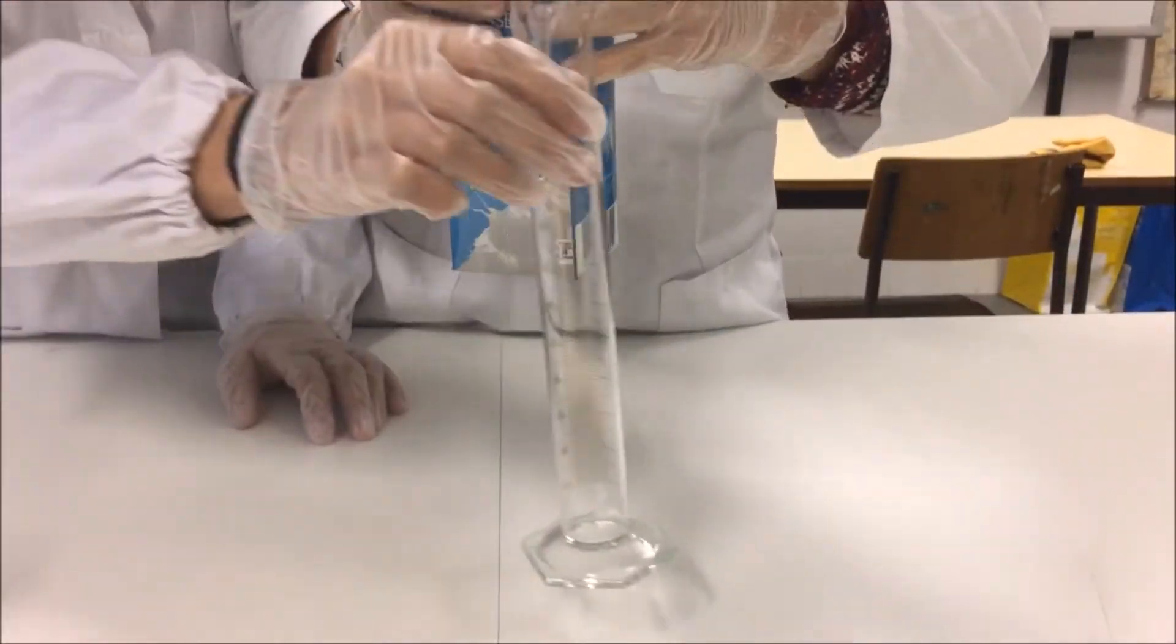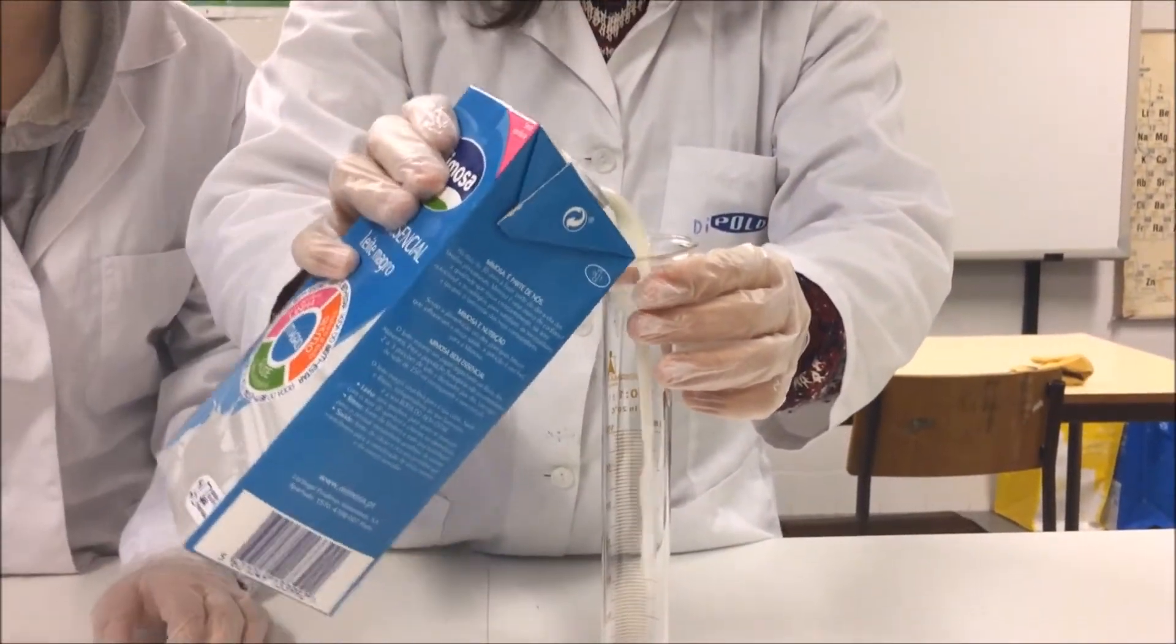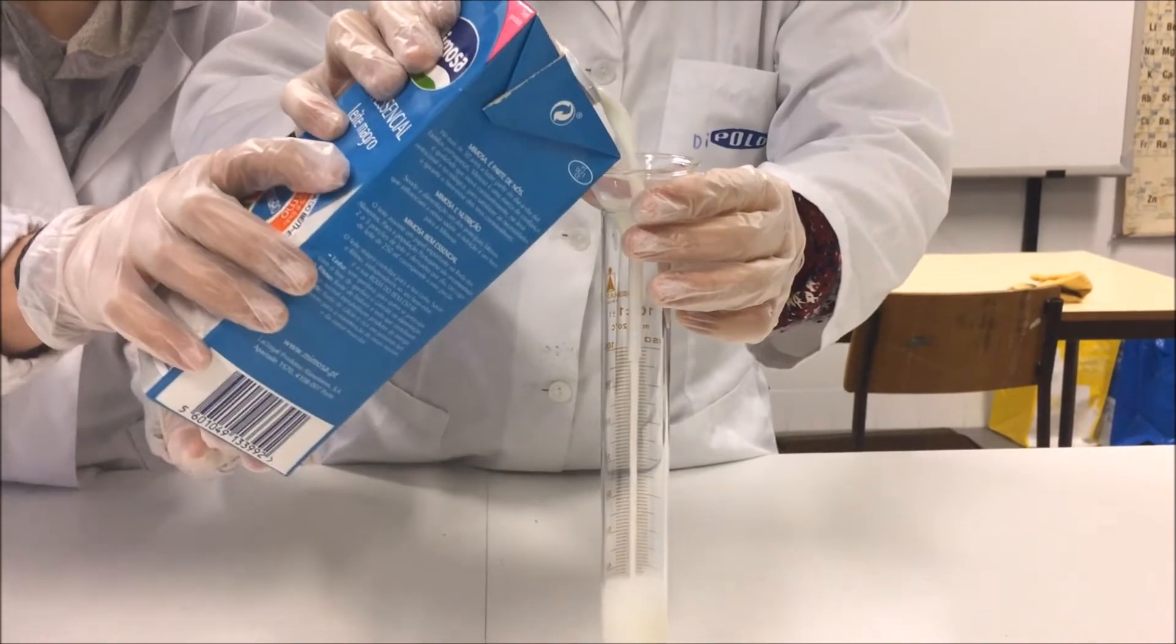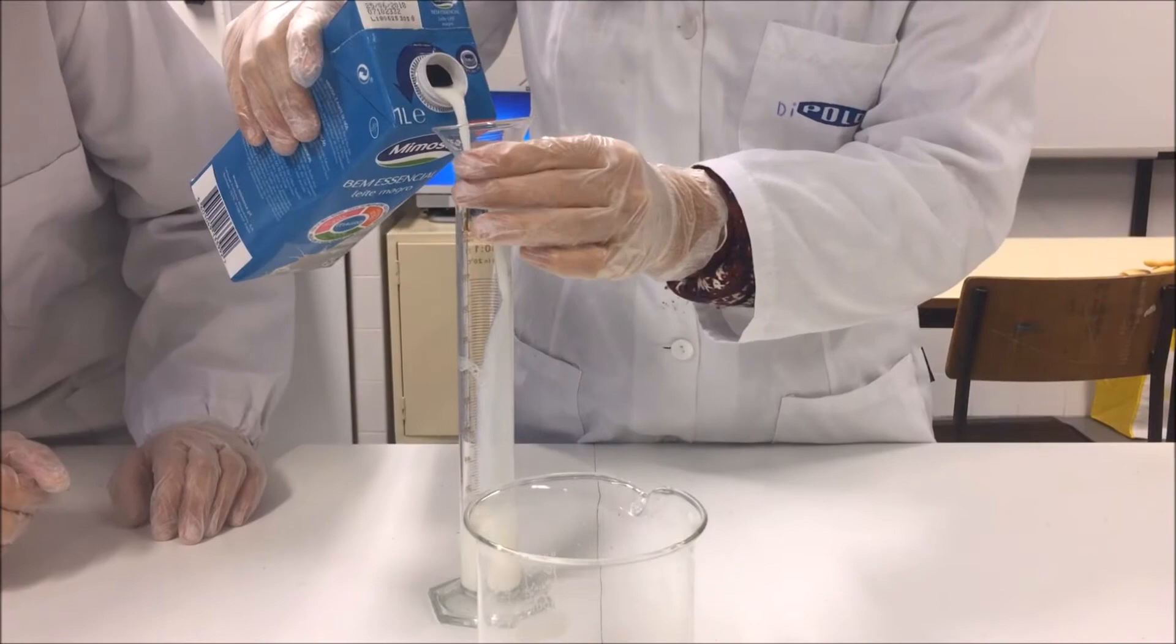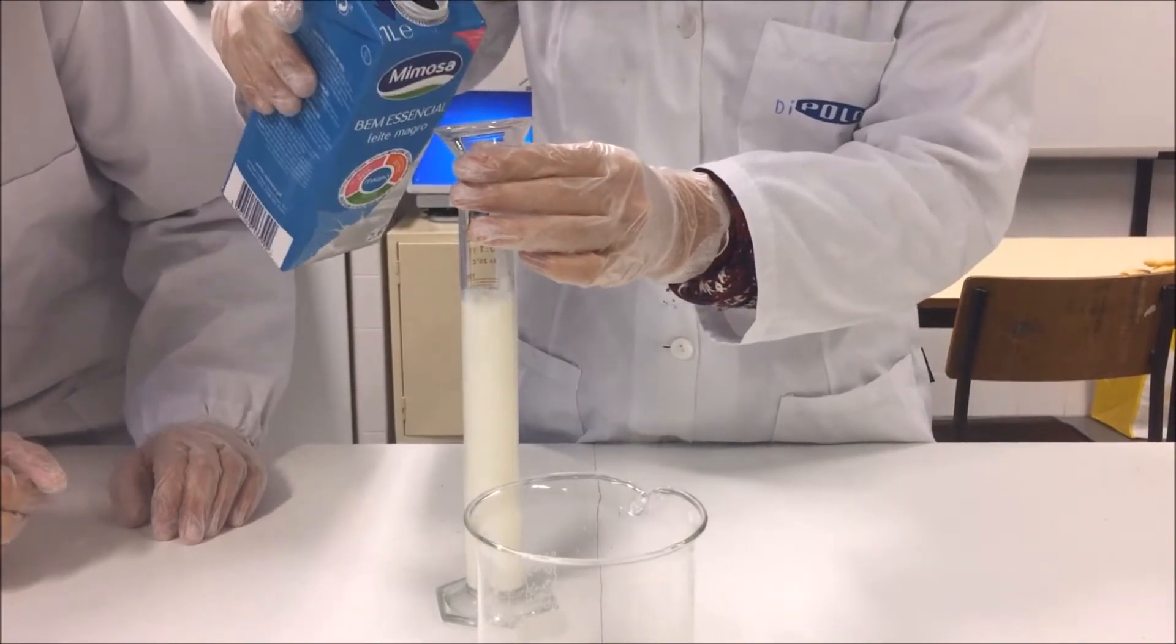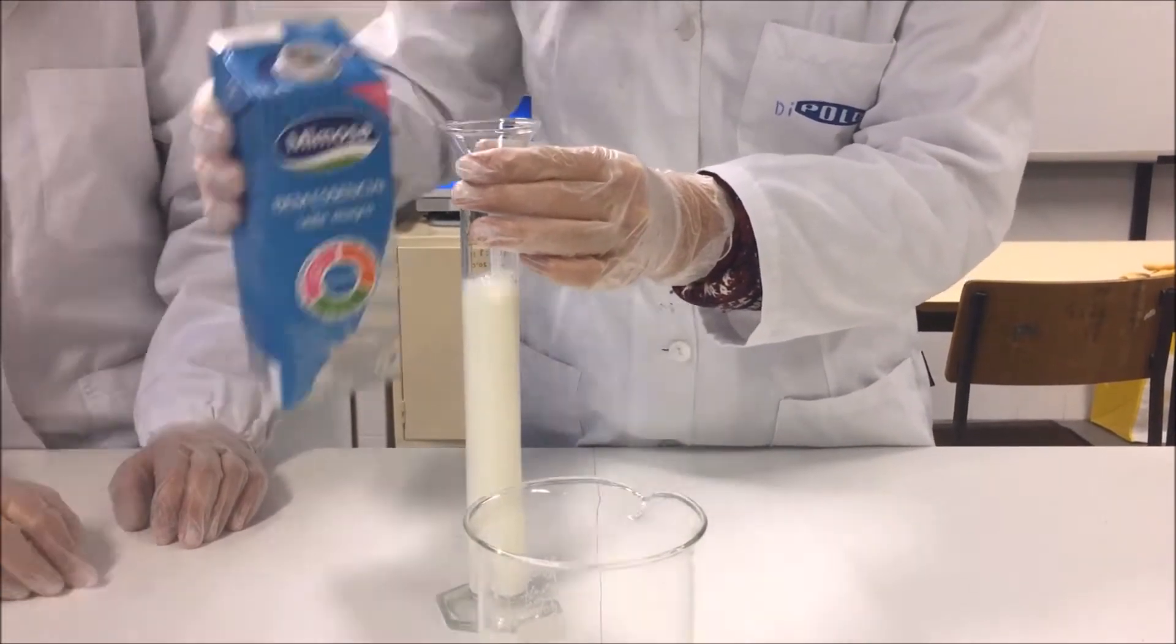The first thing to do is to measure half a liter of milk into the beaker of 600 milliliters with the help of a 100 milliliter graduated cylinder and a glass funnel. As the volume of milk required exceeds the capacity of the graduated cylinder, this step must be repeated five times.